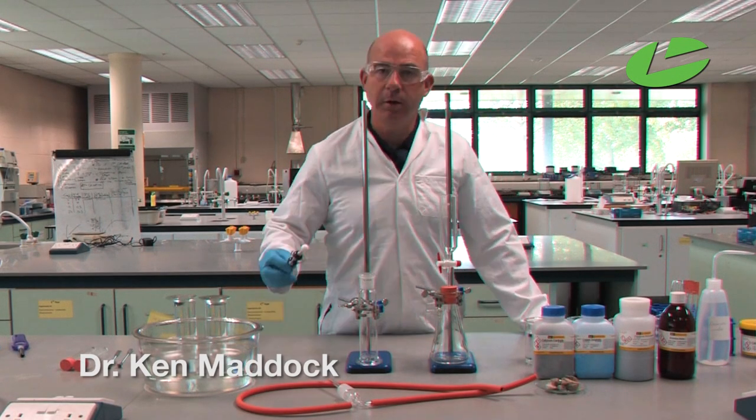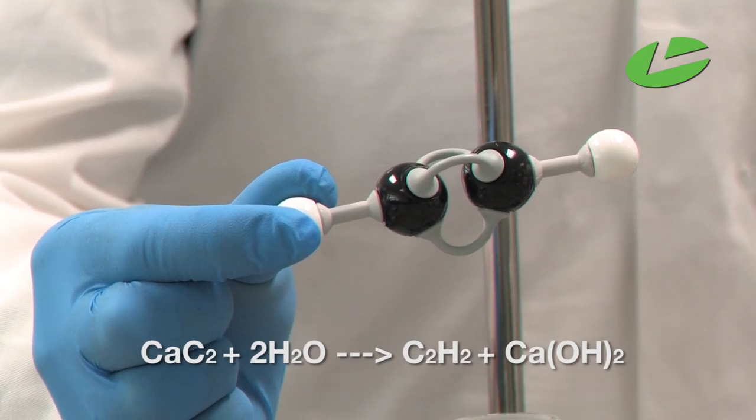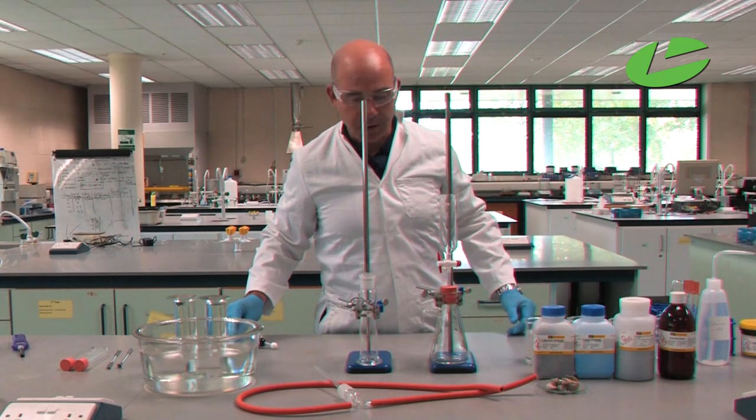In this practical we're going to prepare ethyne gas. Here is the model of ethyne gas: two carbons bonded by a triple bond with two hydrogens at either end.